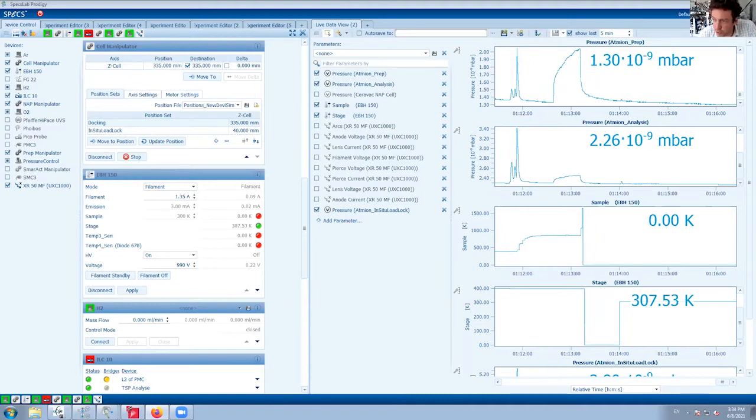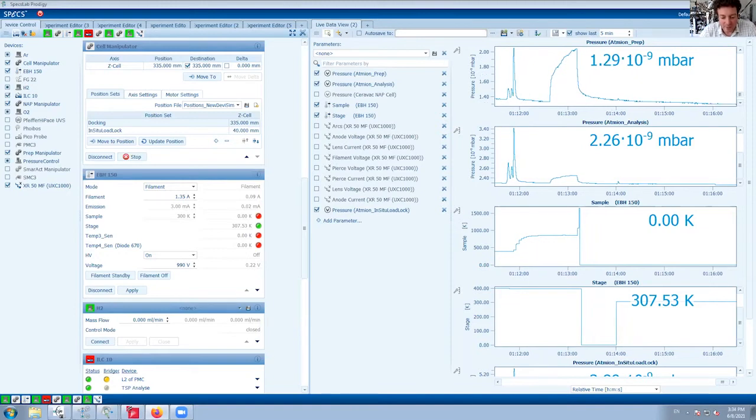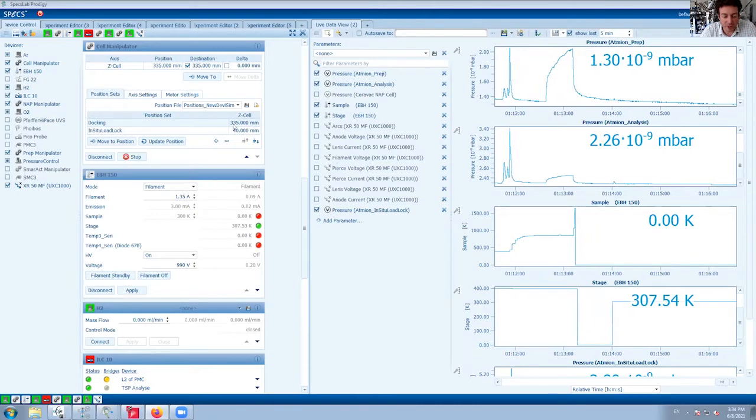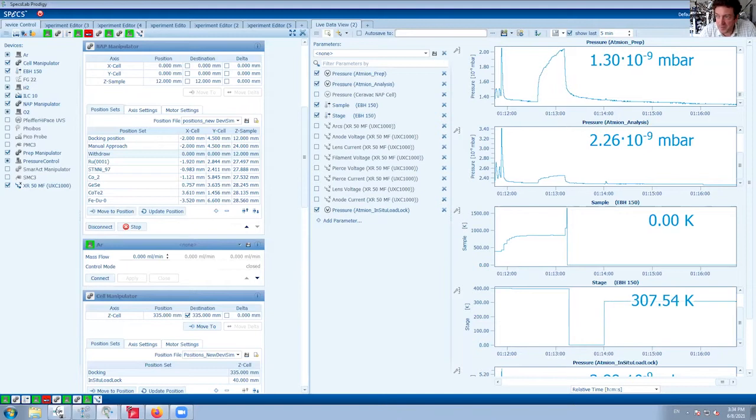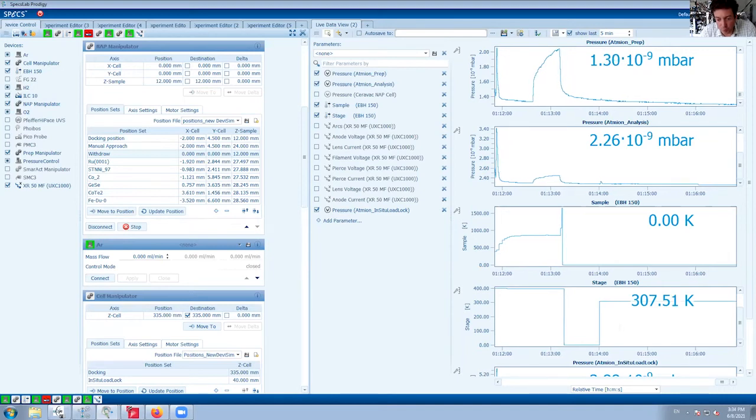We usually use 80 kilonewton with our press, and then the sample doesn't actually get out. You can heat up the sample, you spot weld the thermocouple close to the hole, so everything is in good condition, good contact, and we also did some work with that, so that's also possible.